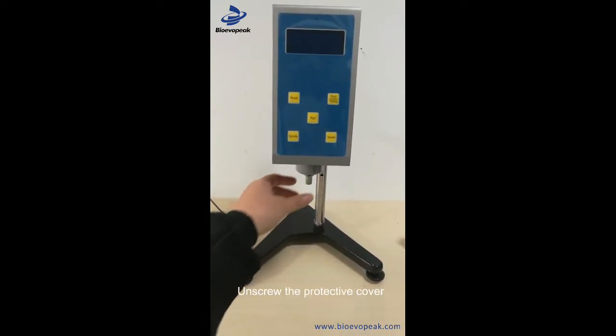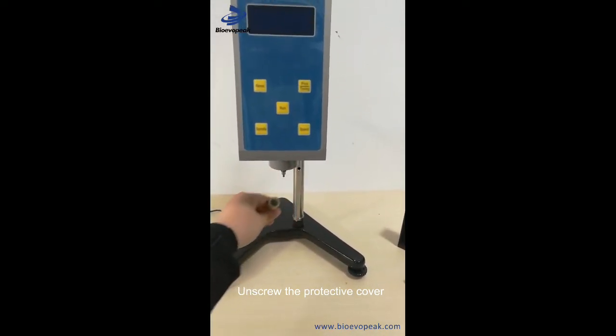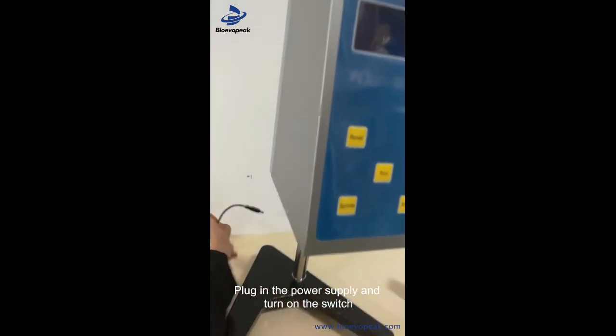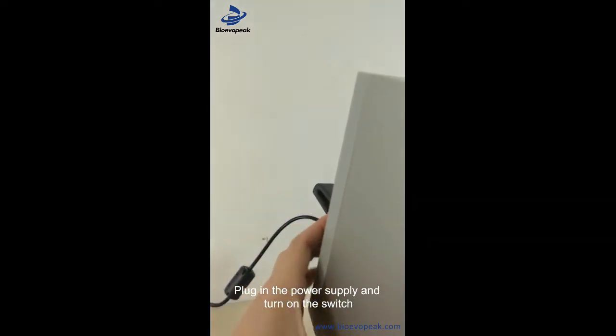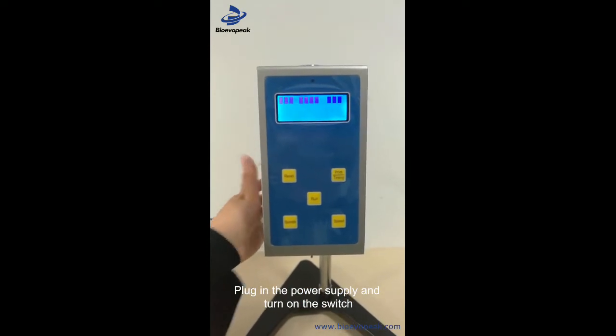Mount the main unit onto the seat frame. Remove the protective sleeve, plug in the power source, and turn on the switch.